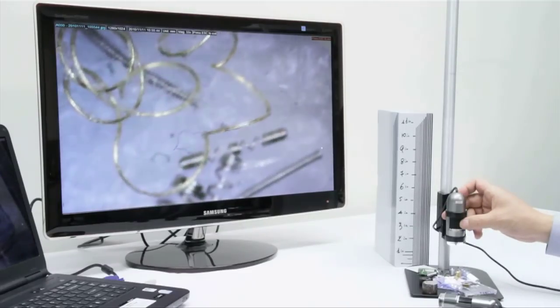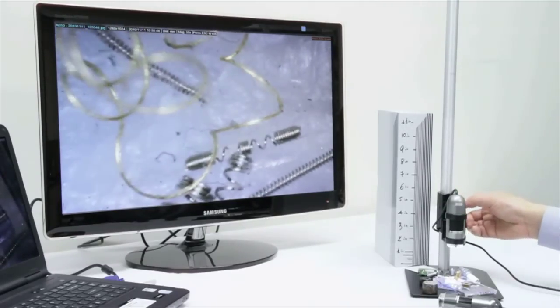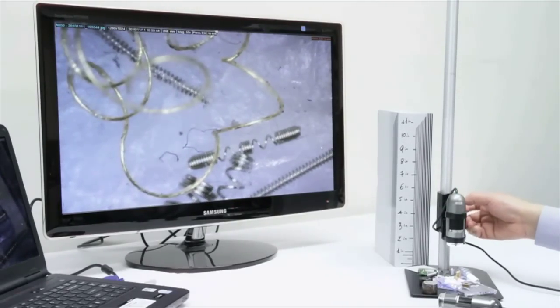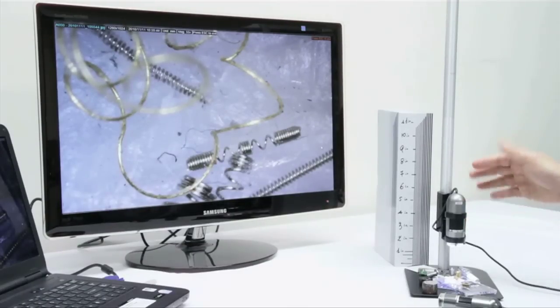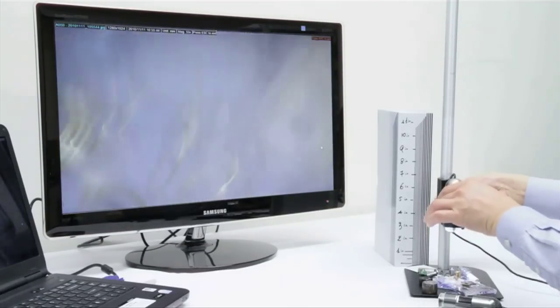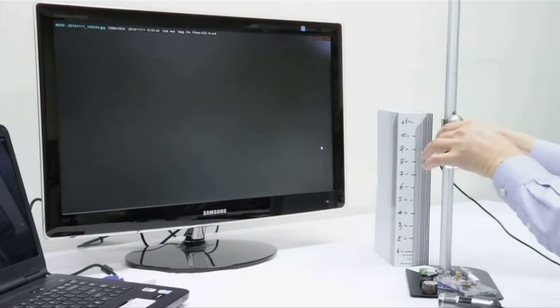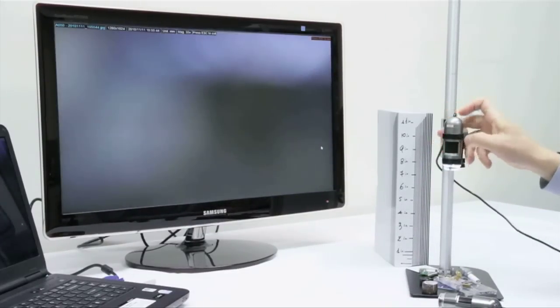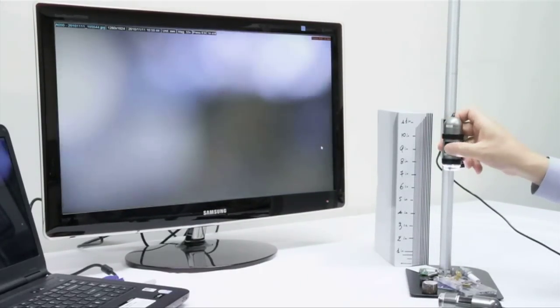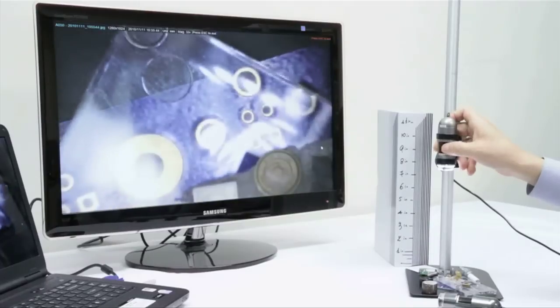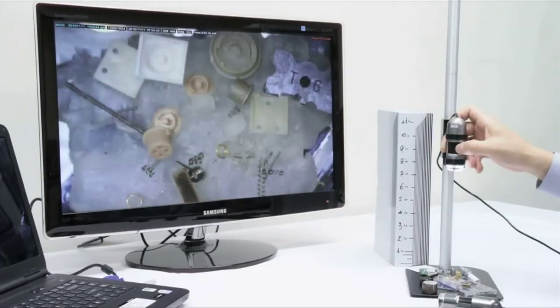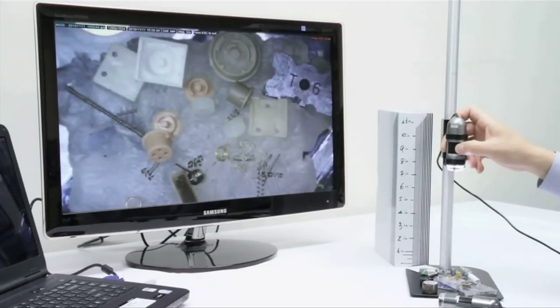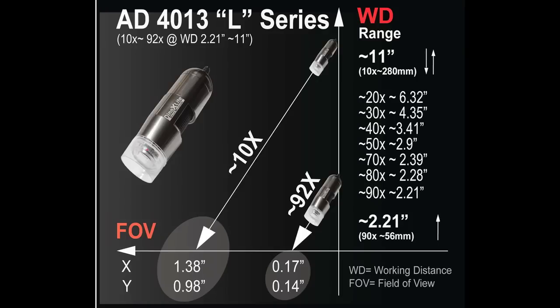If we wanted to get to 90 times, we would just move the dial and then readjust the height of the microscope. If we want to get a lower magnification, we would just move the microscope away from the object. As we move the scope away, you can see here it lowers the magnification, increases the field of view, and we are sitting at about 8 inches away achieving 15 times magnification.